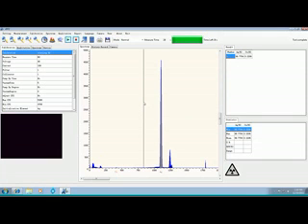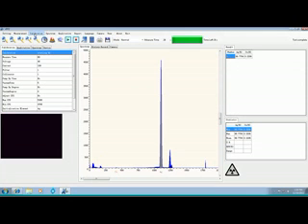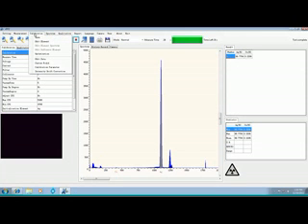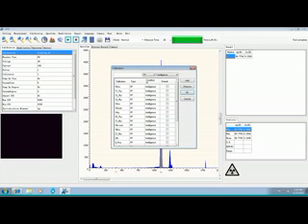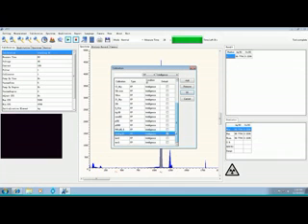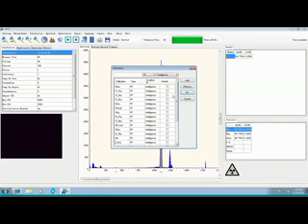Now we have a nice feature about this machine. There's pre-stored calibrations in this instrument and if you go up on a calibration icon or calibration, click on that and say open. This will show you all the files that have been pre-calibrated in this machine. But we don't have to know anything about this because we have a really nice feature called our matching mode. So you can just say okay.